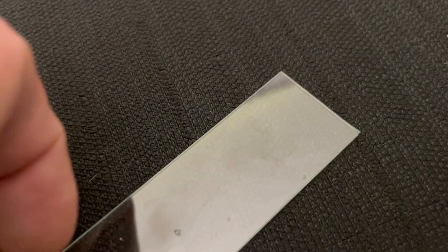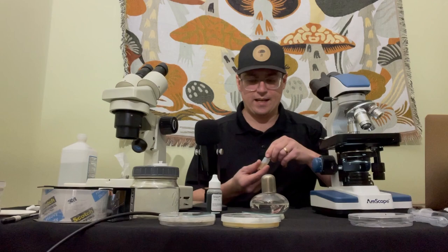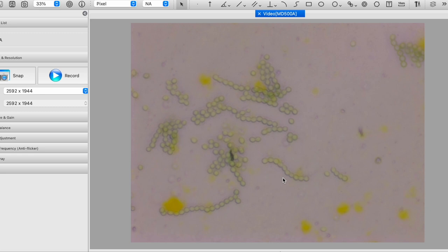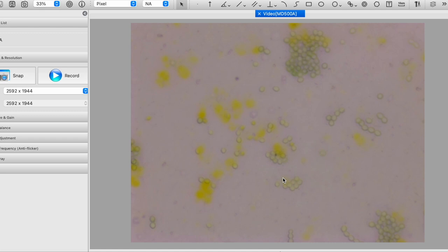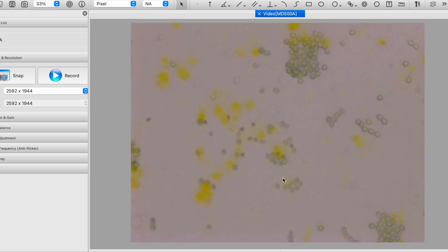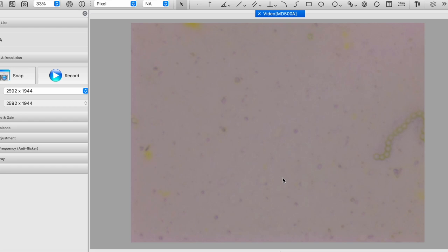Let's take a look under the scope. I've got that prep slide, and I'm going to go ahead and add some oil on that section. I've got some cells in focus here. It looks like they have some pretty good structure — lots of the spores and some fragmented cells from the mold. I'm getting some air bubbles, but it's really cool to see the clumps of different spores and possibly some bacteria. In order to do more identification, I need to get more stains.